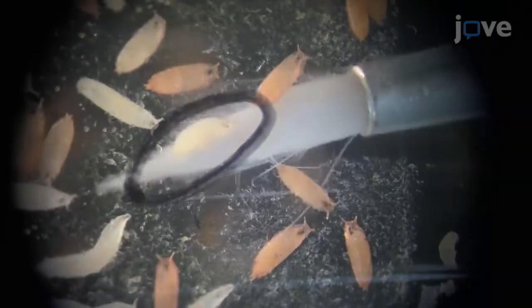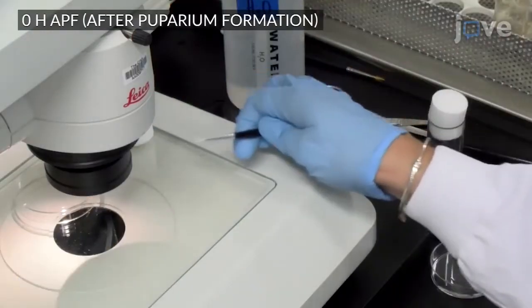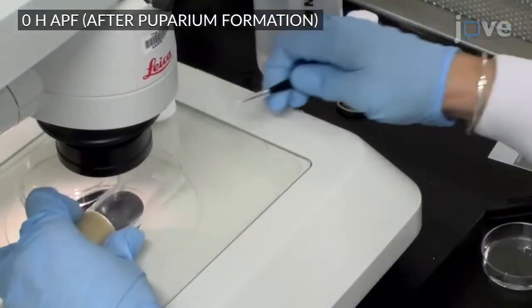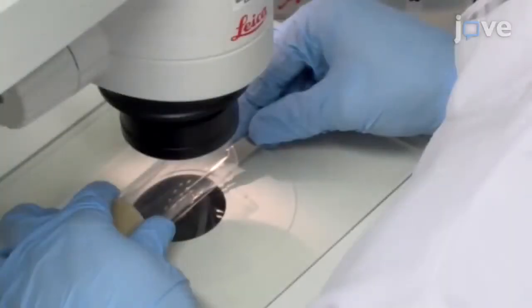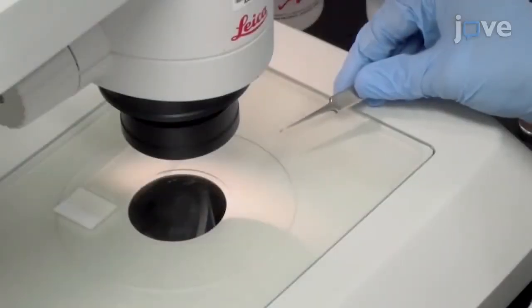To begin, use a moistened paintbrush to transfer staged white prepupae to a fresh plastic vial, and keep them there for as long as necessary at 25 degrees Celsius. Then, remove each pupa from the wall of the vial with the help of forceps.